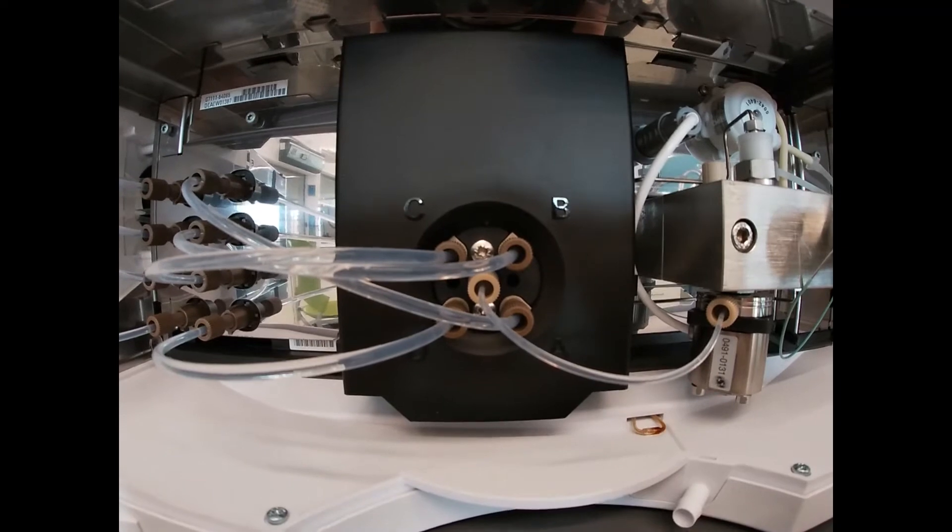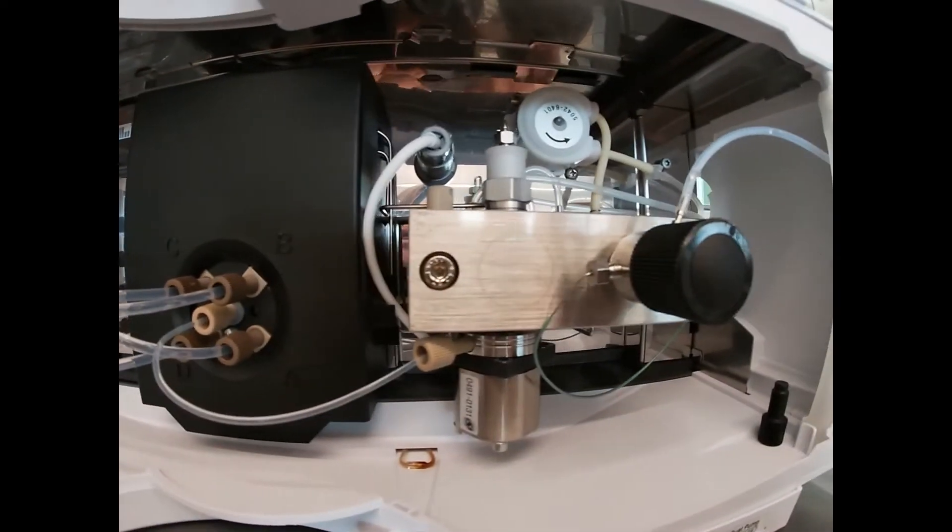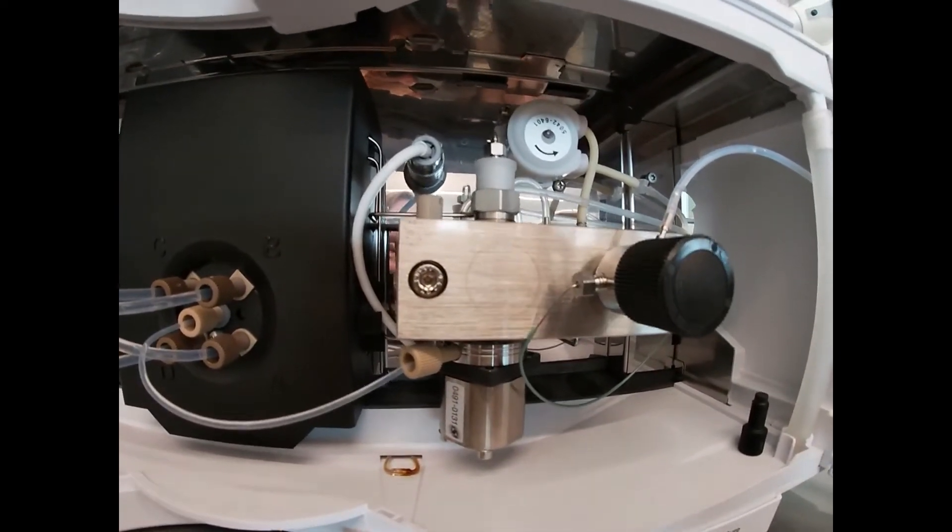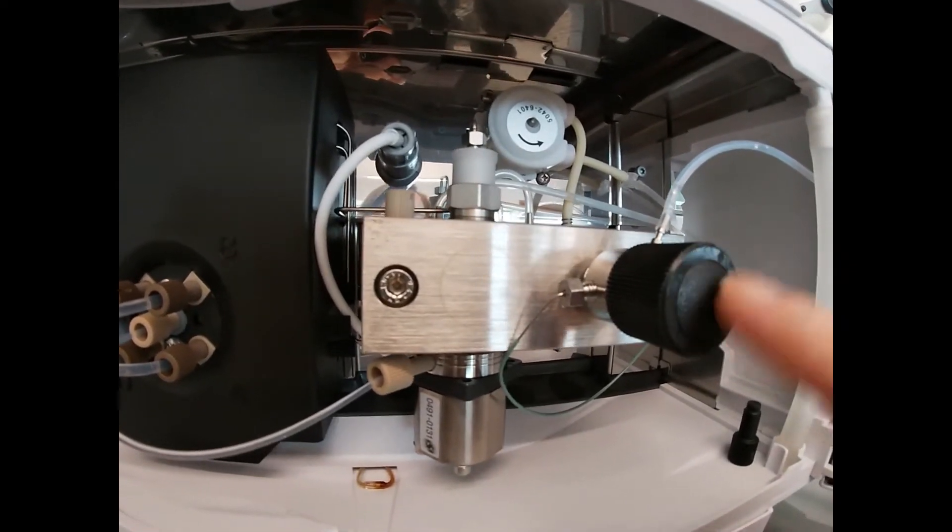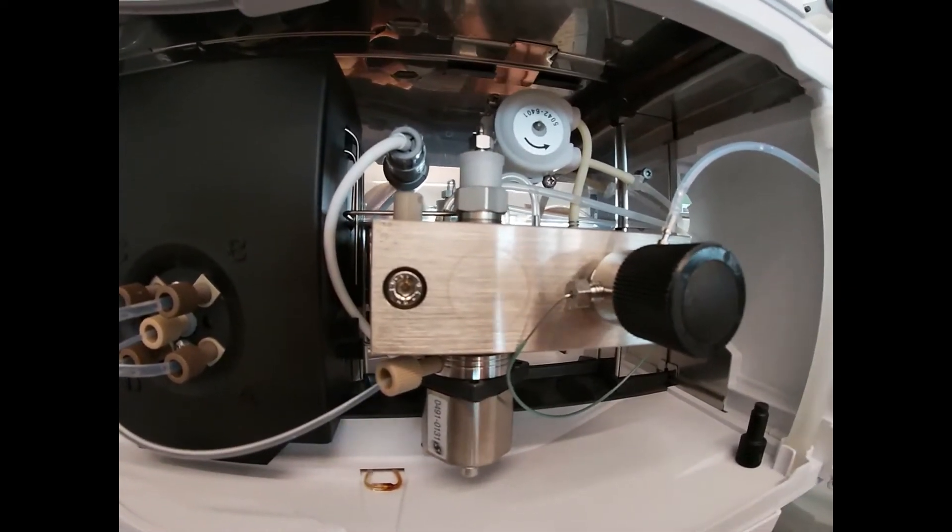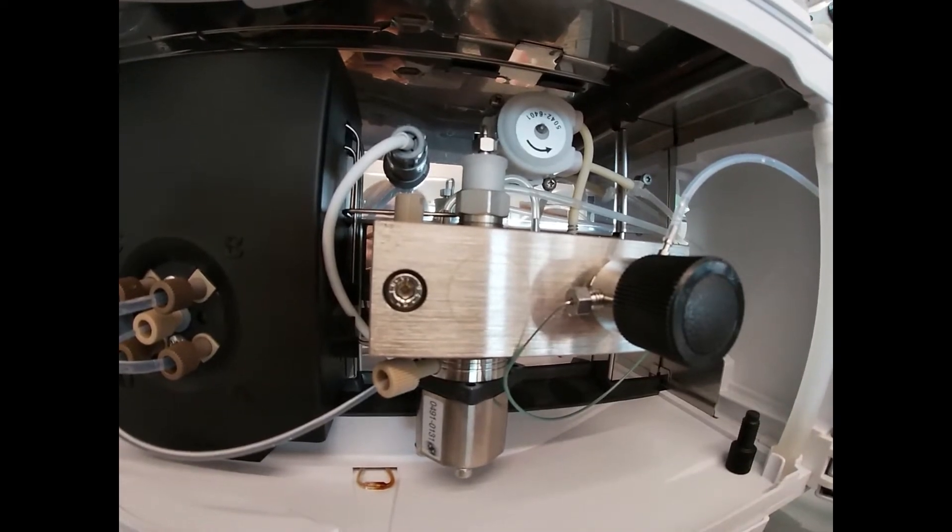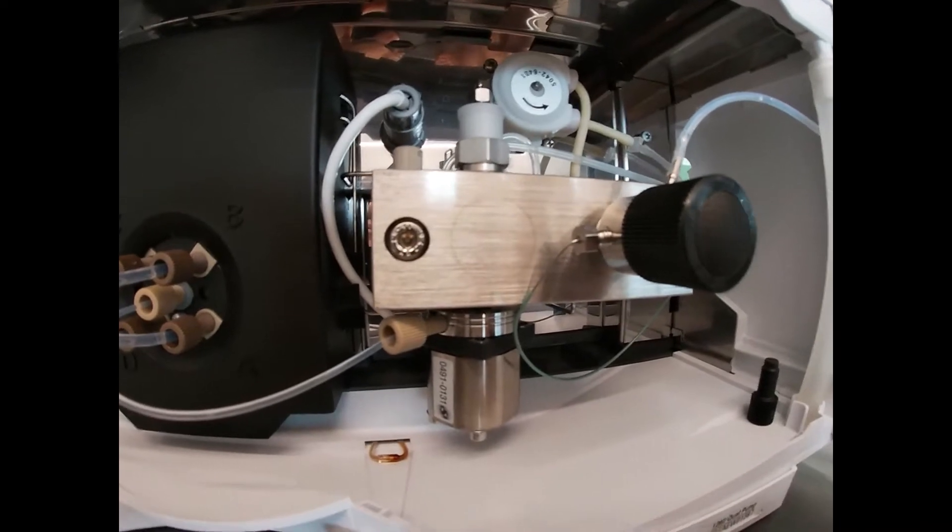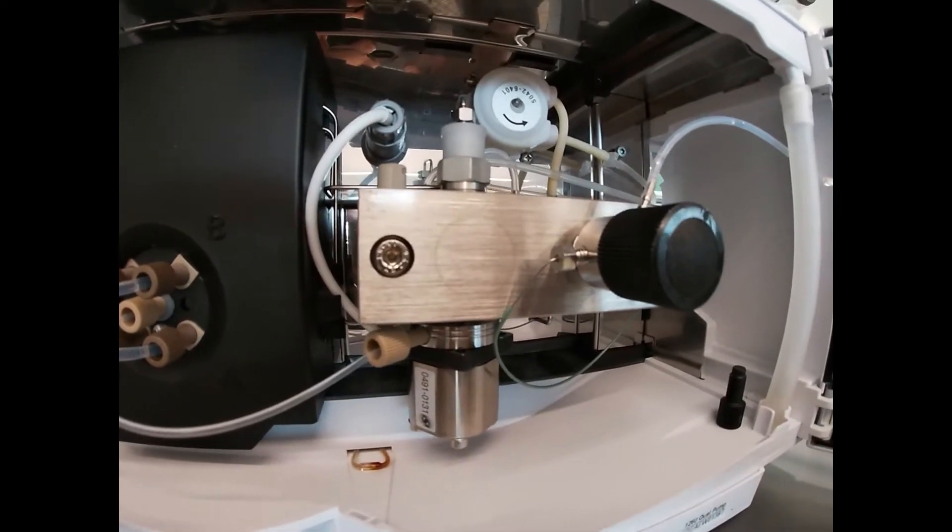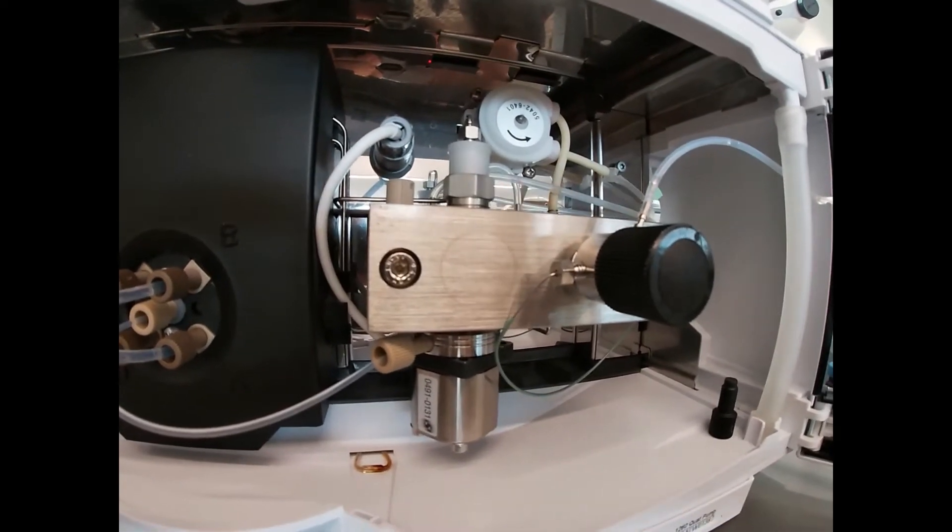We then have a mixing port and a pump assembly. Our pump assembly keeps our solvent passing through the column. Right here we have a purge valve that allows us to clear any air out of the pump as we replace or fill new solvents.